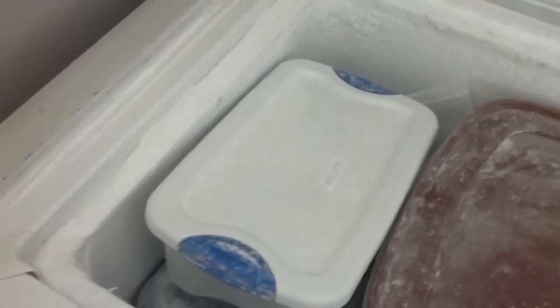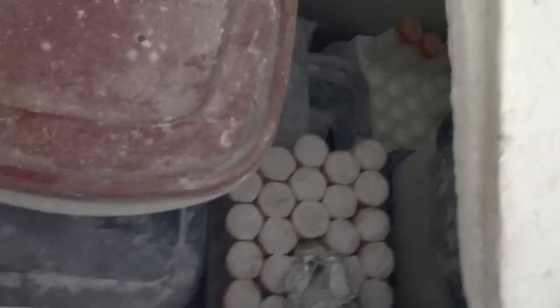What are you doing? I'm making a video. Here's where we keep our samples. All our cells, cell lines.